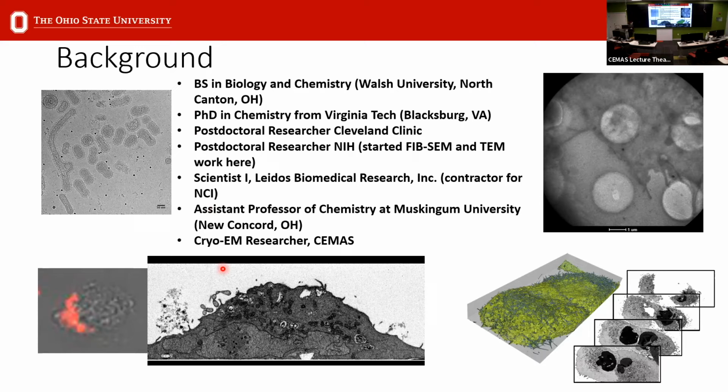So PCR, cloning, things like that. My second postdoc was at the NIH, and here's where I really got into electron microscopy. So I did a lot of Cryo-EM and room temperature TEM, and I've also done a fair bit of room temperature FibSem on resin embedded samples.